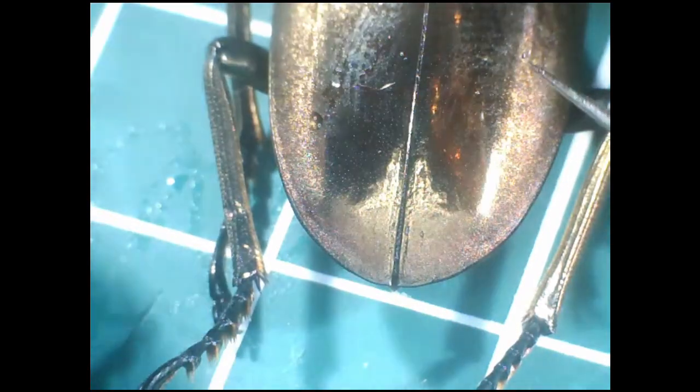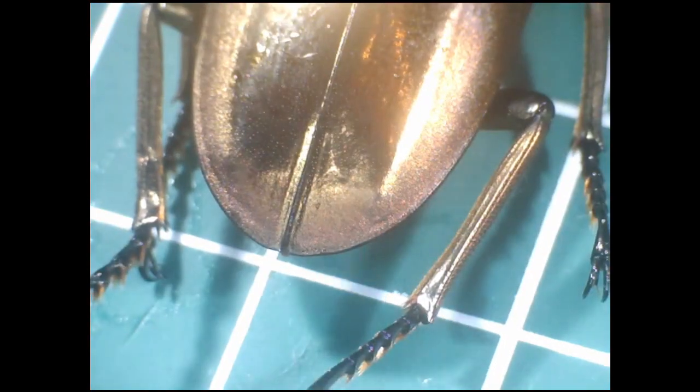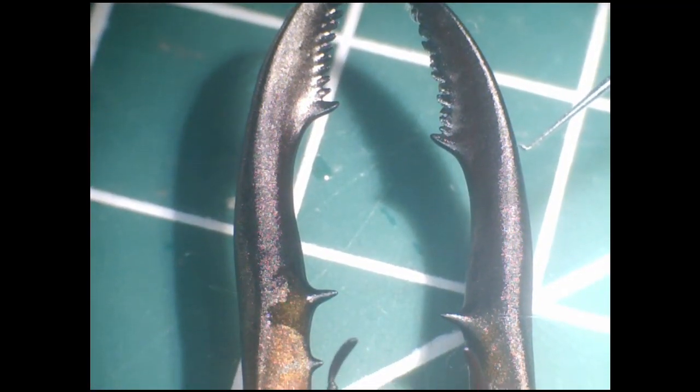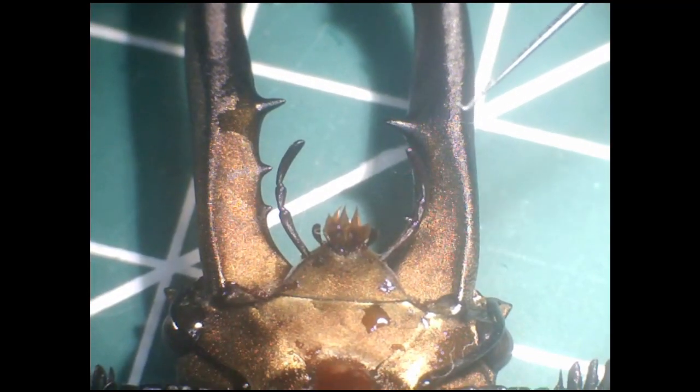I'll try to open the elytra now to show you the wings — it's proving a bit fiddly, so I'll have to do it properly later. I'm going to flip the beetle over now so you can see its underside, the ventral aspect.